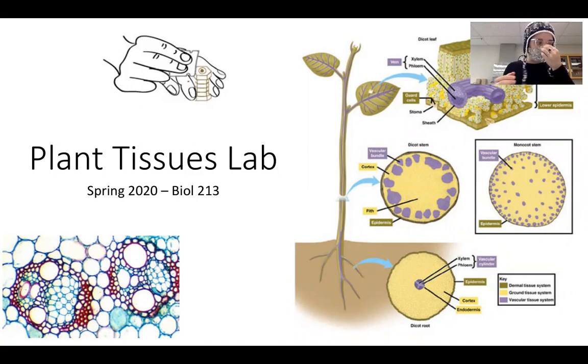All right, so this week we're going to be looking at plant tissues. Before we dive into the specific goals of this lab, I'll give you a brief introduction to tissue systems and the different cell types that you'll see in lab, since I know that we probably won't get there in lecture. However, you will, and Dave will help explain this when he does.